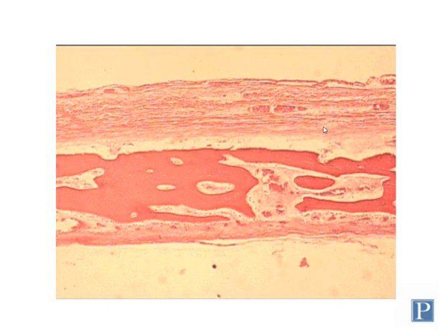So moving along, this is a section of bone from a developing flat bone of the skull, and this slide reflects one of the ways in which bone can develop. This type of development is called intramembranous development. That's how flat bones form. You can see that this bone is stained, which means it's been produced by decalcification methods. So this is a decalcified bone that's been stained with H&E.